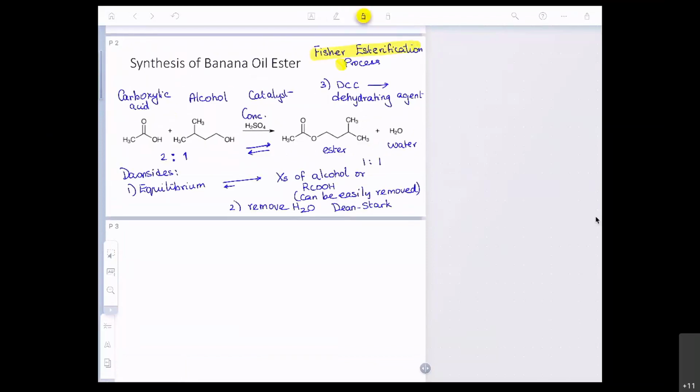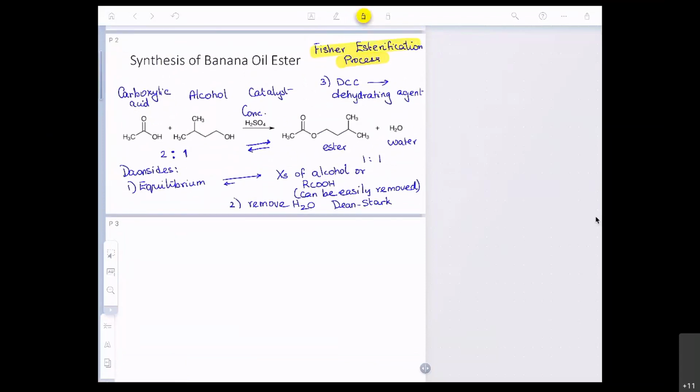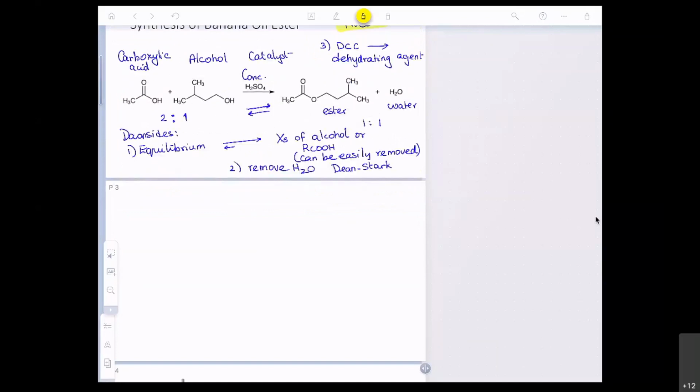It's a classic methodology. I won't say it's a great methodology, but it's a quick and easy one. We use it in the lab with a modification, and I'll talk about the modification later in this PowerPoint, but it's a straightforward method that leads to the formation of esters. So let's take a quick look at the mechanism of this reaction.